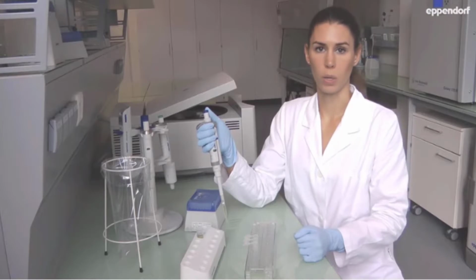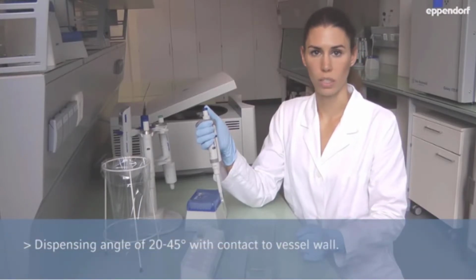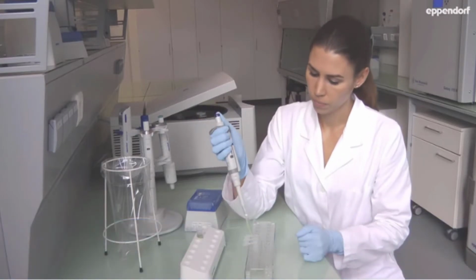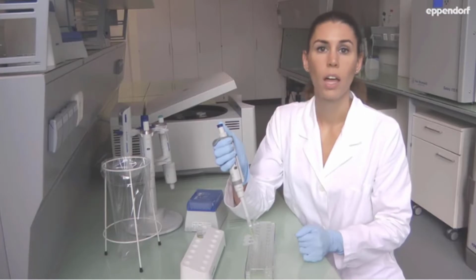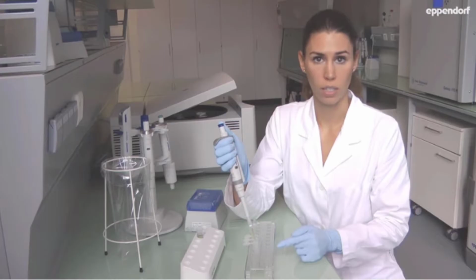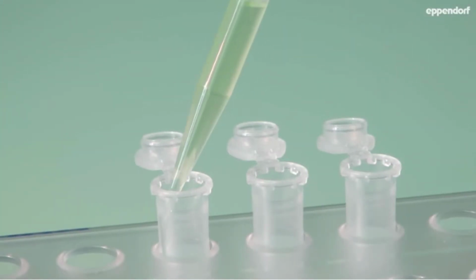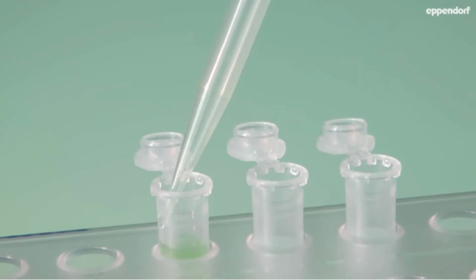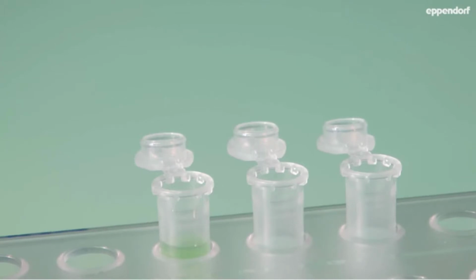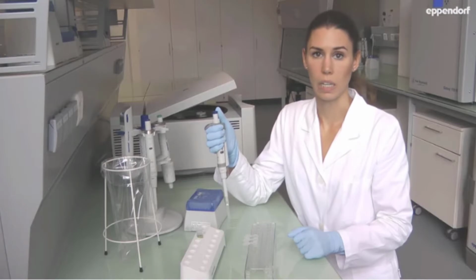When dispensing liquid, the angle of the pipette should be between 20 and 45 degrees, whilst the tip should stay in contact with the vessel wall. This guarantees optimal flow of the liquid into the target vessel. Press the control button down to the first stop. Then perform the blowout by pressing further down to the second stop. This ensures that the tip is emptied completely.